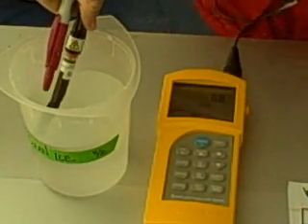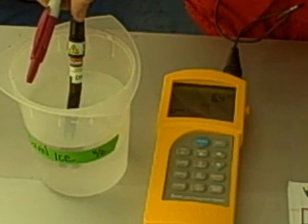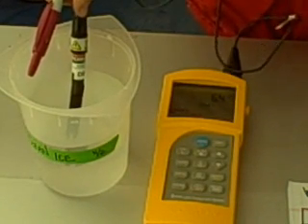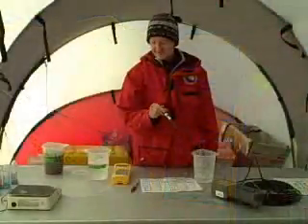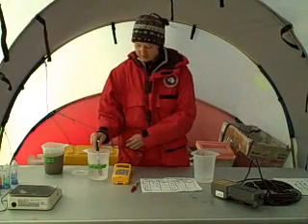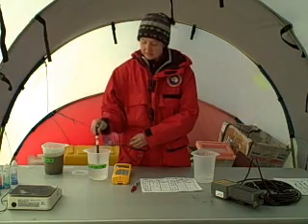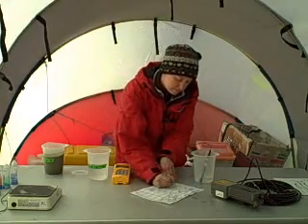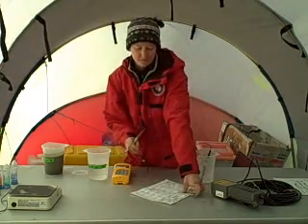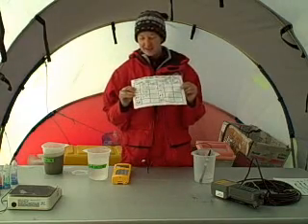So we put it in solution. And once again, we get 6.4. And for our third clean ice measurement of pH, stick it in, and this time it is 6.5. So now we have our 3 measurements. Our first one was 6.4, our second one was 6.4, and our third one was 6.5. So now you can do the average on that one.